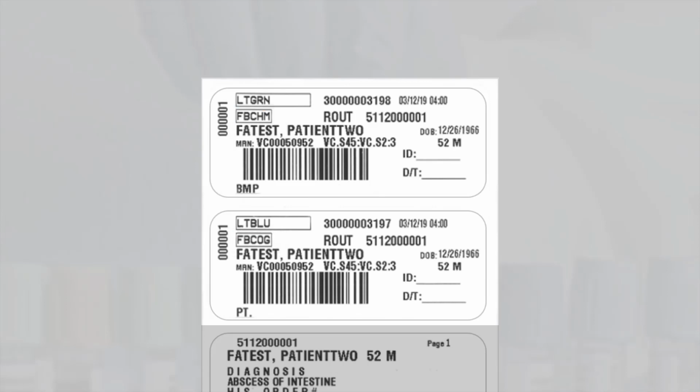And one last thing before we move on. This is the area where the person obtaining the specimen will initial and write the date and time of collection. For any urines and fluids, you should also include source information.